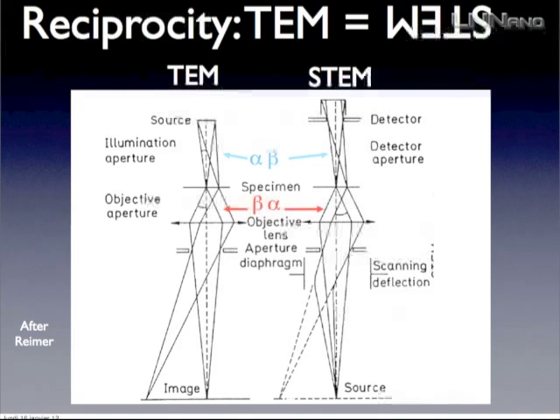And it turns out, if you discuss with people from the TEM coming to the STEM, that when we see a prime and we fix it, they have exactly the same prime and they fix it. So I give just an example. It may happen a lot of time in an STEM that you see in bright field image some astigmatism. Okay, you have some astigmatism, and it's very odd because you spend all your day or all your morning to align your column, and usually you align your column not on the bright field but on the HAADF signal.